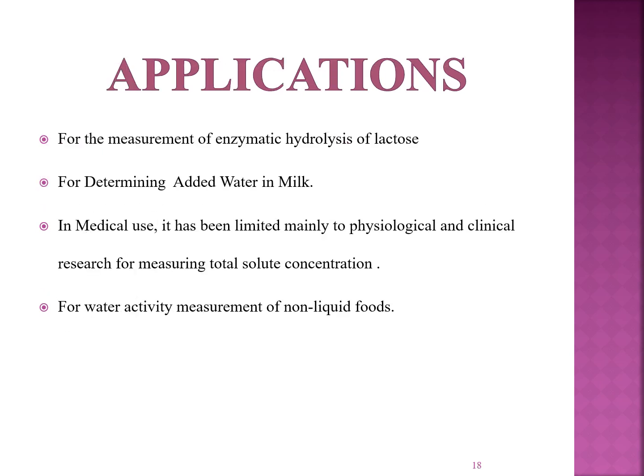There are various applications of cryoscopy. It is used for the measurement of enzymatic hydrolysis of lactose and for determining added water in milk. In medical use, it has been limited mainly to physiological and clinical research for measuring total solute concentration. It is also used for water activity measurement of non-liquid foods.